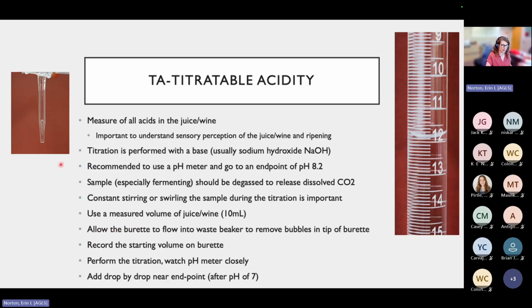When you fill up the burette to begin with, and I highly recommend you get a decent burette, and if you need help sourcing that, let me know. You will not have any sodium hydroxide in the bottom. So you open up the stopcock into a waste vessel, and some will start to flow, but sometimes you get these bubbles that linger. You need to get rid of those bubbles, okay? Because they can wreak havoc on the volume that you're trying to determine with this titration. So you want to make sure that there are no bubbles. And the way to do that, open the stopcock really quickly until you get those bubbles to release.